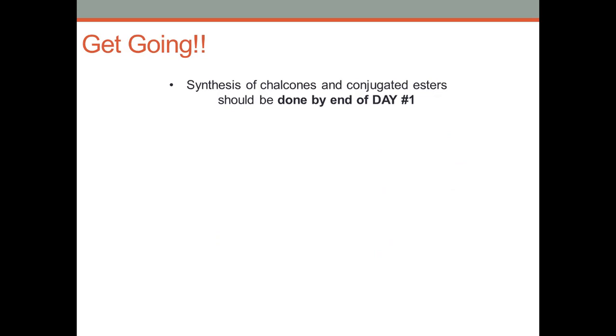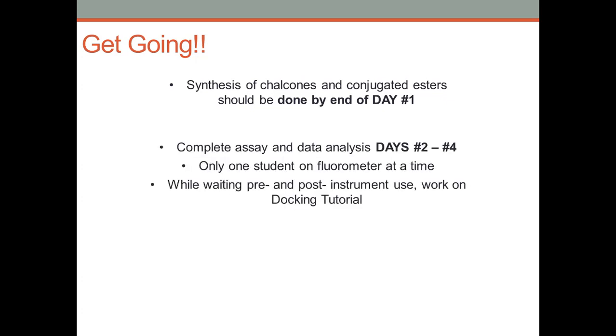So finally, you need to get going. This is a long experiment, and there's definitely a bottleneck at the assay step. So if you can, do your best to get your synthesis done on day 1 so you have as much time as possible for the assay and analysis. We only have 1 fluorimeter, and so while you're waiting to get on the instrument, or if you're an early user of the instrument, be sure to work on the docking tutorial.